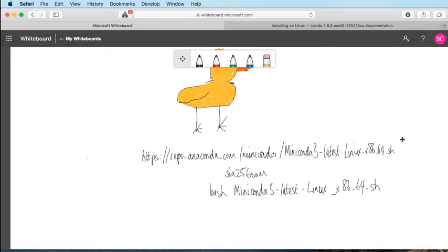So that was the installation process. And then what I talked about was two things. I talked about environments.